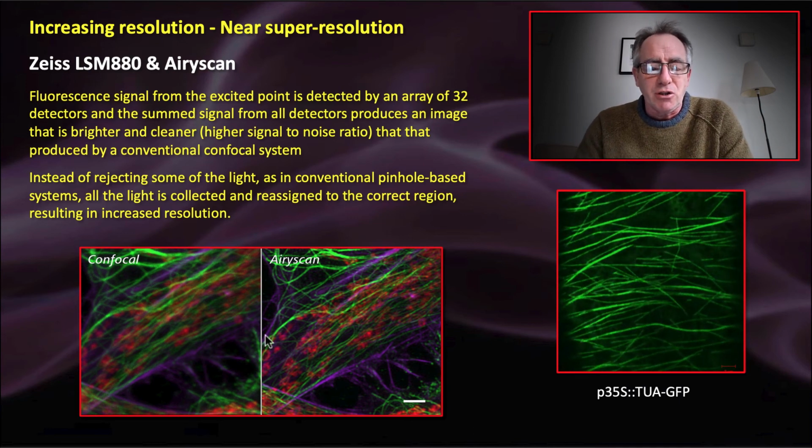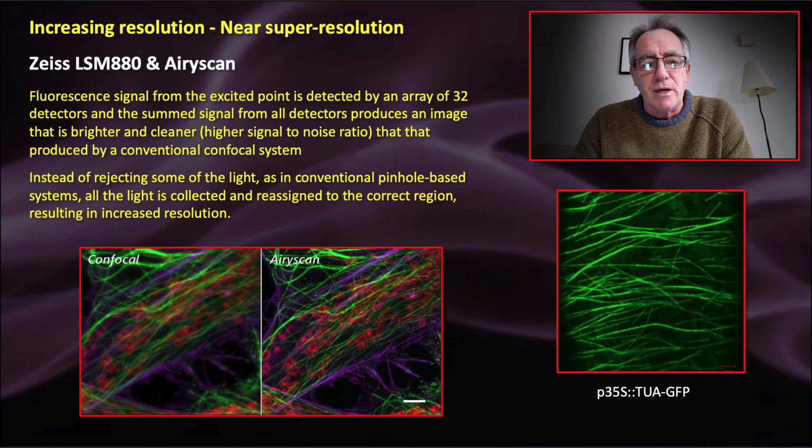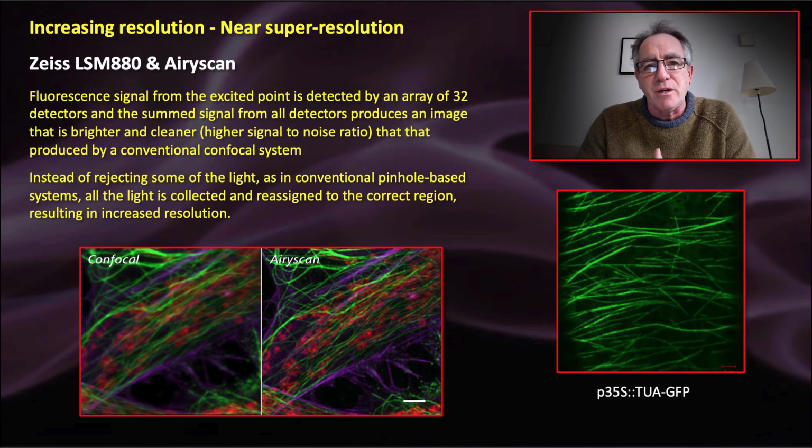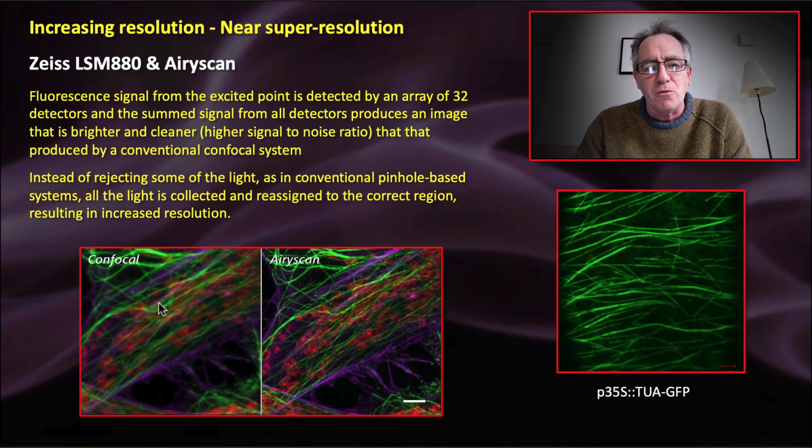If you look at the images down here in the bottom left, this is a cell. It's got some cytoskeletal elements marked in green and various other things marked in purple and red. I don't even know what the other structures are in this picture. By the way, there could be an image to the left of this over here that showed regular epifluorescence. If you were seeing the view through a regular fluorescence microscope, you would just see a blur. You would see some green and some purple and red, but you wouldn't really be able to make out what the structures were. So this image here shows the confocal microscope picture, and it's generally a nice, clear, really amazing image. It's really very beautiful.